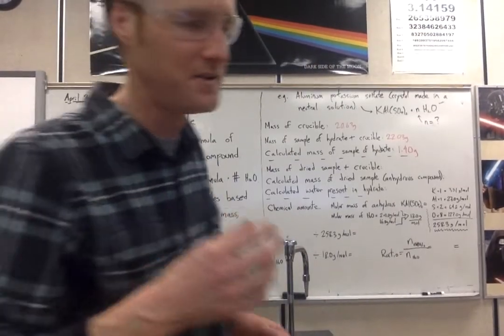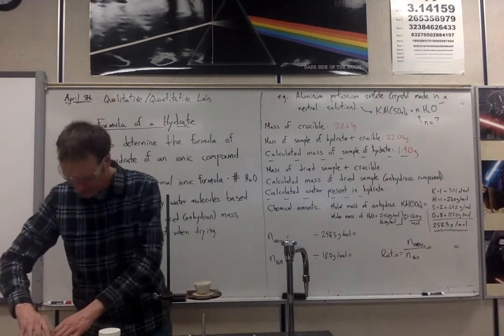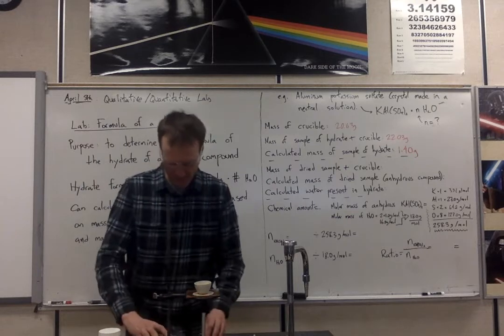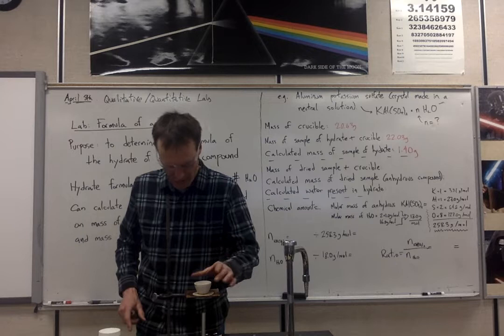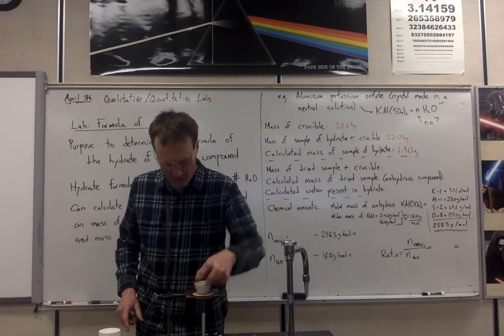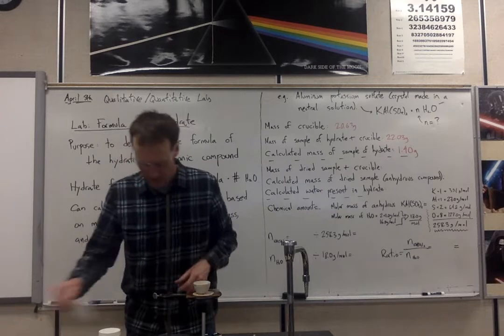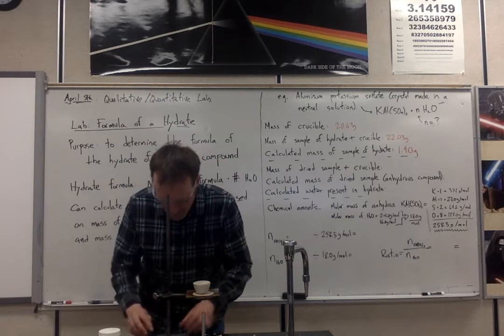I think I'm probably not going to burn my fingers now if I do this mass, so let's make it happen. Still pretty hot.